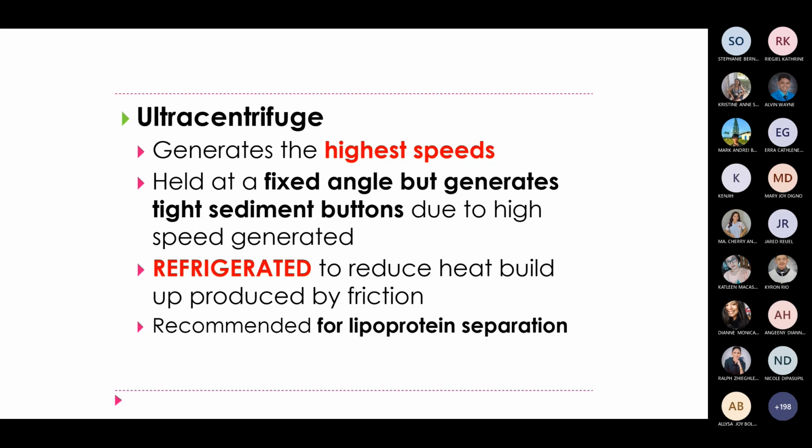Why? Because of the highest speed generated. And with high speed, of course, more power or energy of the centrifuge is used. That's why it is refrigerated, to reduce the heat buildup produced by friction because it is so fast. And this is recommended for lipoprotein separation.